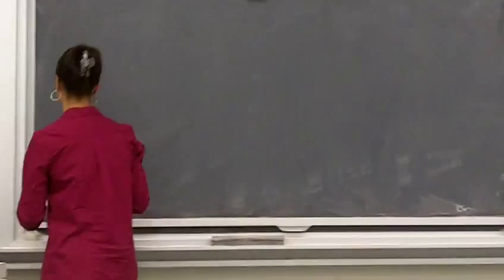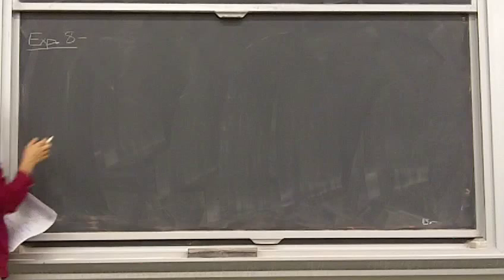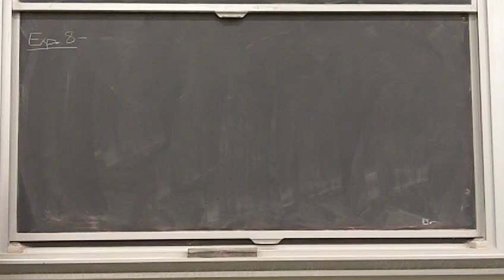All right, now here we go. We've got to finish up a couple things with Experiment 8 before we can start looking at Experiments 10 and 11. When you come to lab this week, you need to have completed all the way through the simple distillation of your ether from last week. So you need to make sure that is done before you come to lab this week.